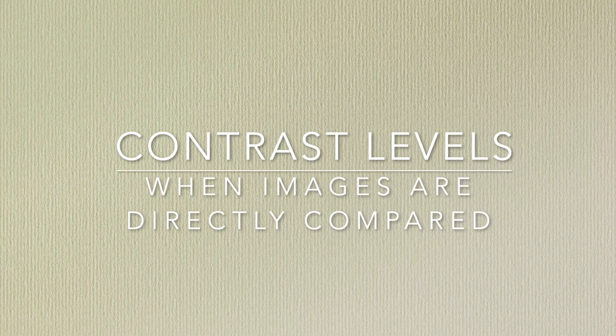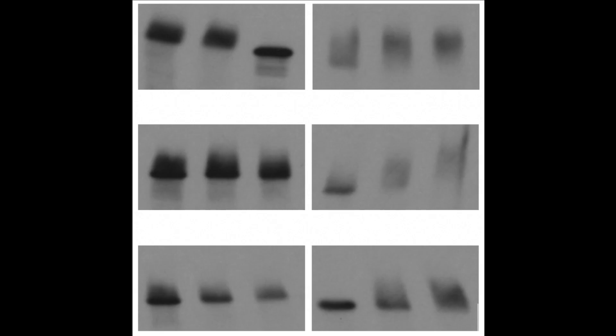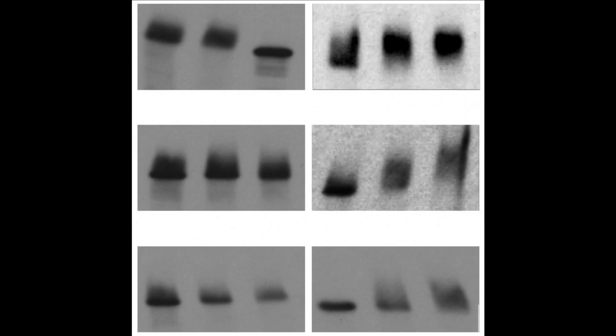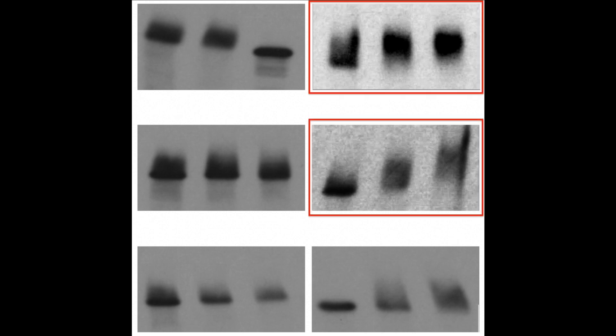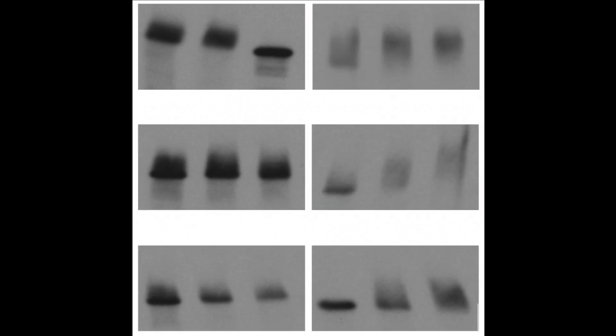Also watch out for contrast adjustment across images that are directly compared to each other. For images to be accurately compared, they should be acquired with identical settings, and any processing should also be identical. The two marked-up panels on the right here have been contrast adjusted, and the signals now appear much stronger relative to the ones on the left. This does not accurately represent what was observed in the experiment.